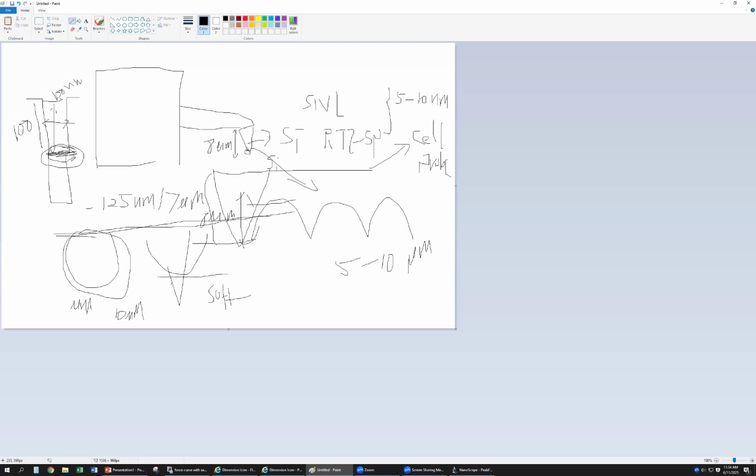Not possible. You get the feature okay if you just use the probe, but the probe cannot be like that. You should use this kind of probe to get the deeper feature.